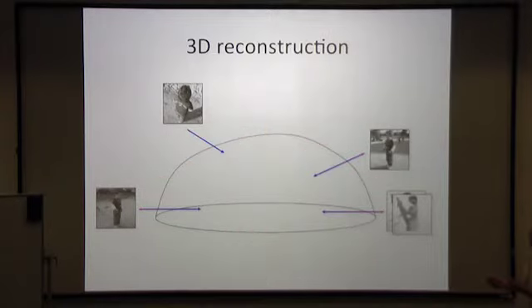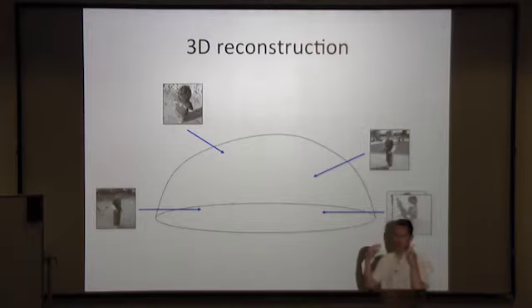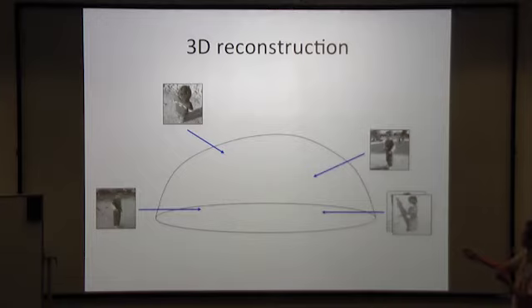And then we can use that complementarity that different 2D views provide of a 3D object, and our brain kind of does that the whole day. We have two eyes and we move around, so we get two-dimensional images on our eyes, but our brain reconstructs in 3D. We'll get back to a more mathematically satisfying explanation later. But we can then do a reconstruction of all these images of Jan. Now, what goes in the reconstruction are only that. They are images of Jan.